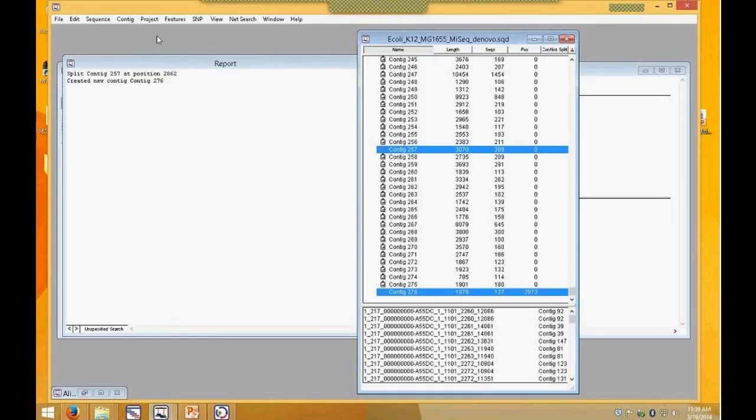And now at this point, I might be doing some gap closure. I might have decided, well, that area was thin. Maybe I did a PCR amplicon. I added another sequence to the project. And again, there's a whole webinar dedicated just to gap closure. So in an area like this, I might actually have added another sequence. I'm just demonstrating now I can break contigs apart. I can put contigs back together.